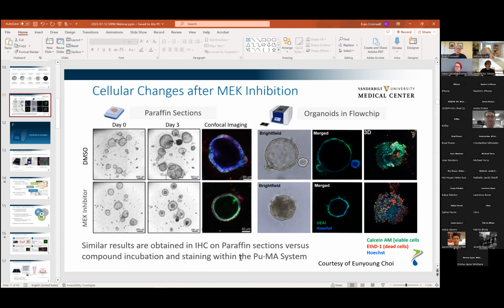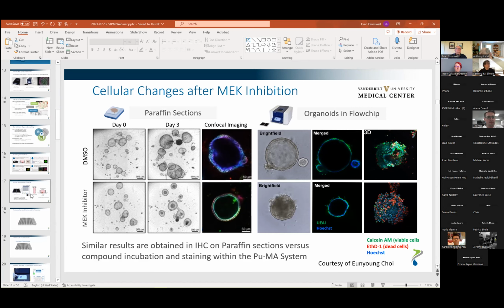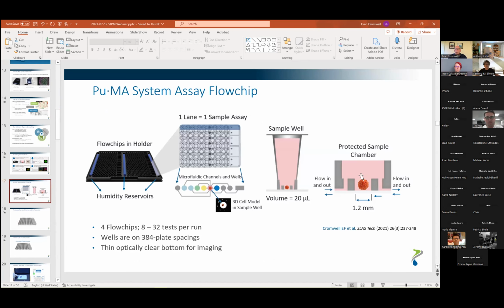Having said that, we've also done work where you can put a higher concentration of hydrogel just in this bottom chamber, about 2 microliters. It sounds like a small amount, but with practice, it's fairly easy to dispense 2 microliters in here. And we've done up to 80% hydrogels in here.